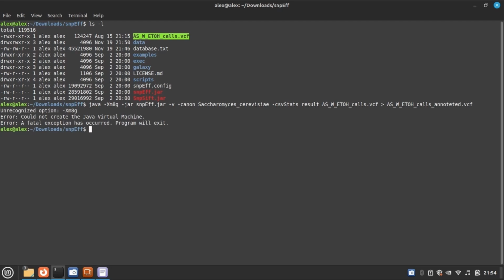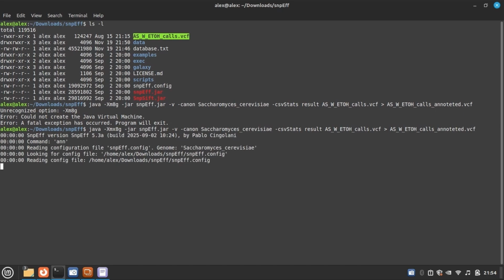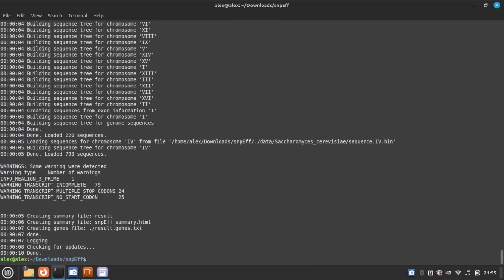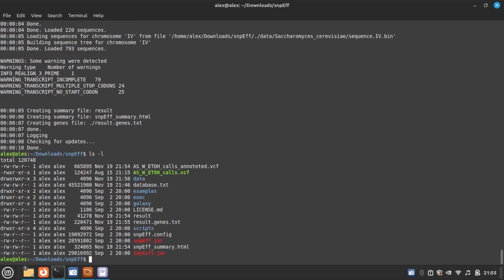Okay, I just made a mistake here. There is a command, capital X here. Okay, so this is the command. Let's enter. Now it is working. Okay, done. Let's check it in the terminal.